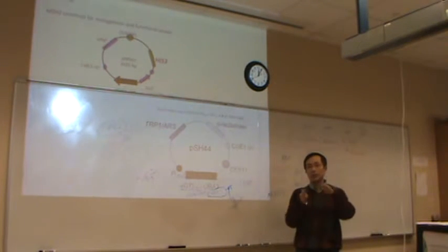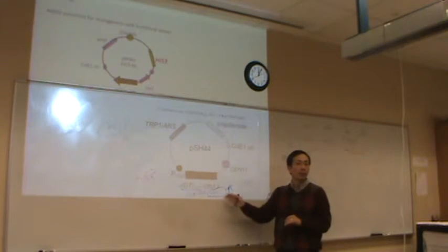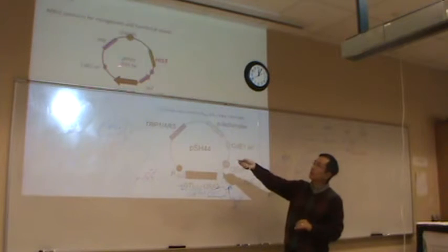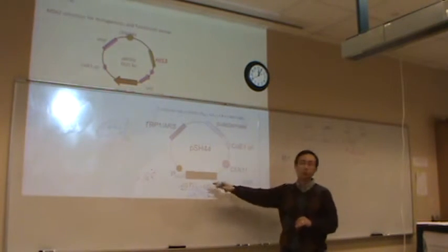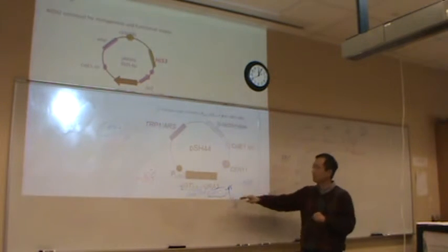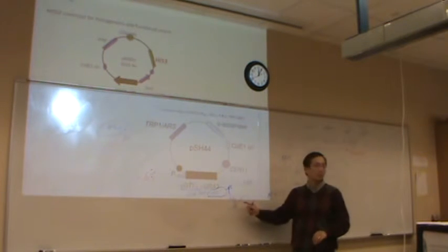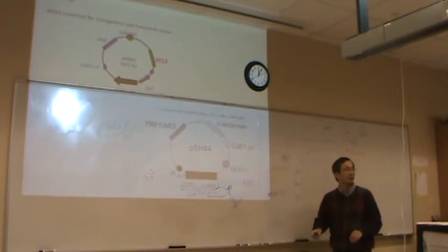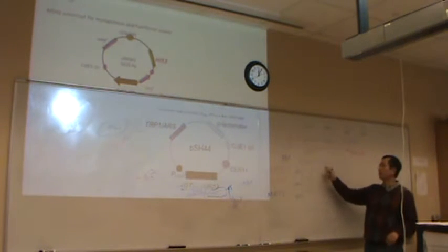The microsatellite has a very high frequency to lead to a frameshift mutation. But when the MSH2 is functional, it's going to repair this. So for the wild type MSH2, the URA3 is most likely functional, which means the cell will not survive on the FOA plate. So for wild type, you'll see very few colonies here.